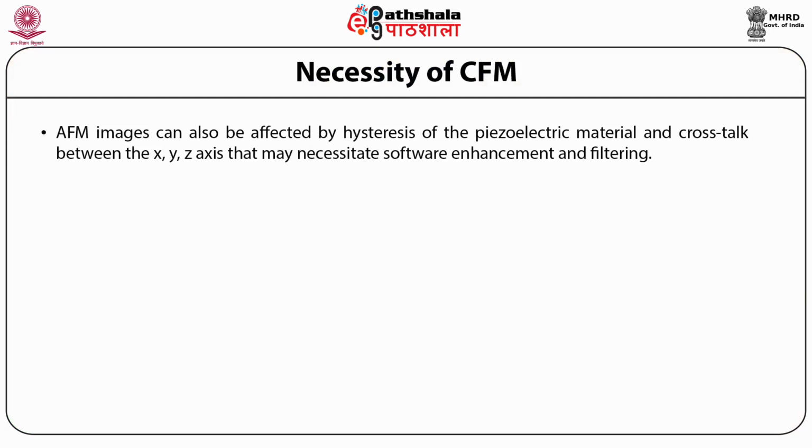AFM images can also be affected by hysteresis of the piezoelectric material and crosstalk between the X, Y, Z axes that may necessitate software enhancement and filtering. Chemical force microscopy is very similar to this, and this is what we notice when we study AFM imaging in similar environments.